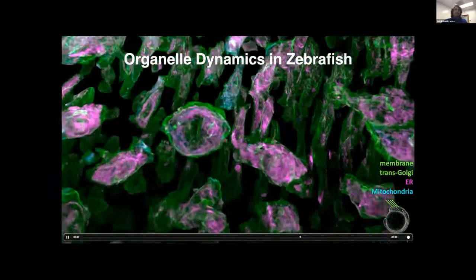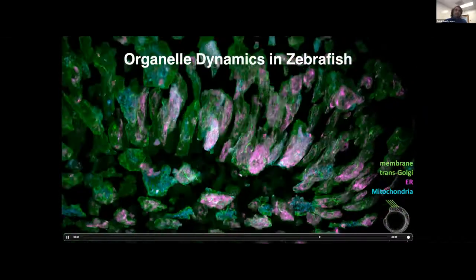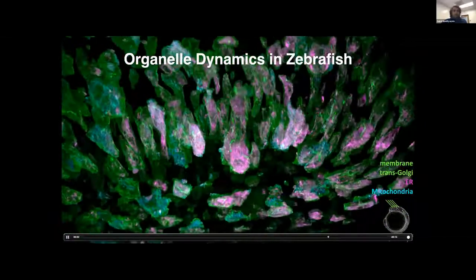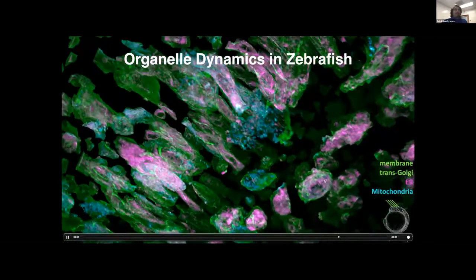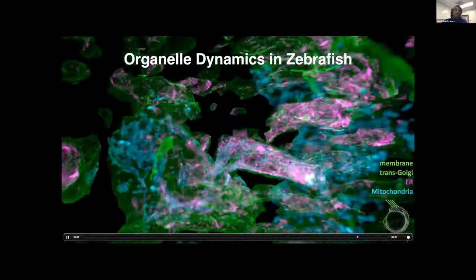And in a second, I'm going to turn off all of the cells except for just one, so that we can focus on the quality of data and the types of questions one can ask with this level of detail that we have access to in these microscopes. So I'm going to turn off everything except for this one particular cell.